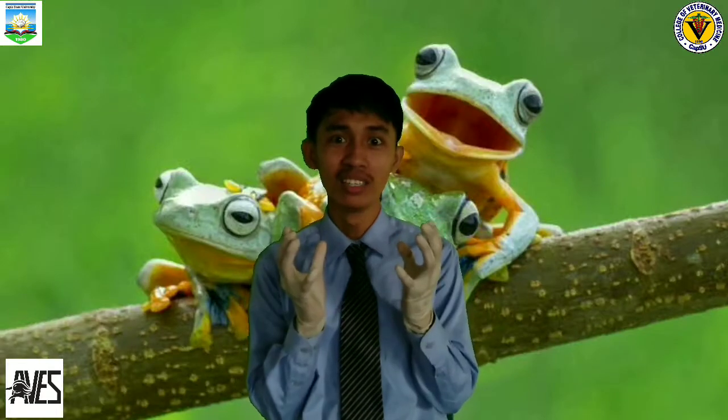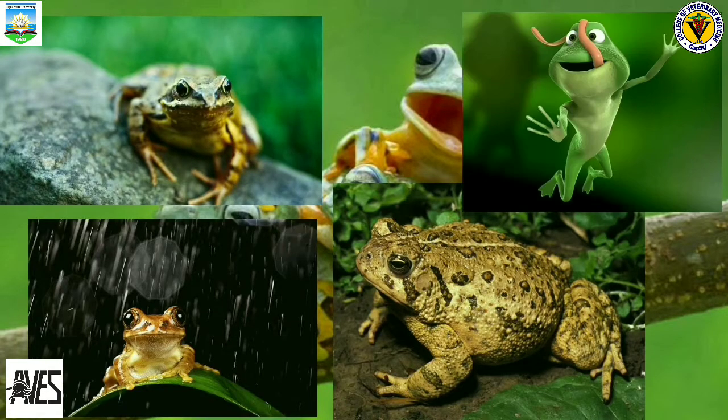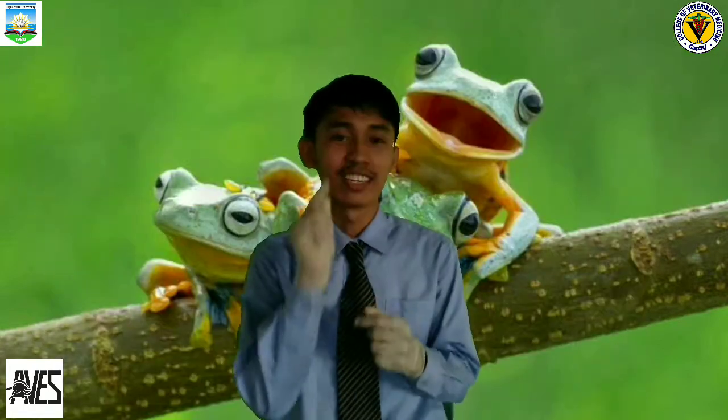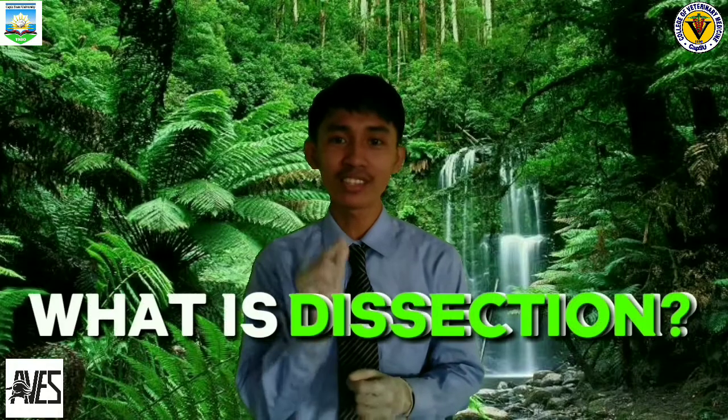Hi! Today we're going to dissect a frog. A frog? Yes, a frog. But before we dissect, let's talk first. What is dissection?